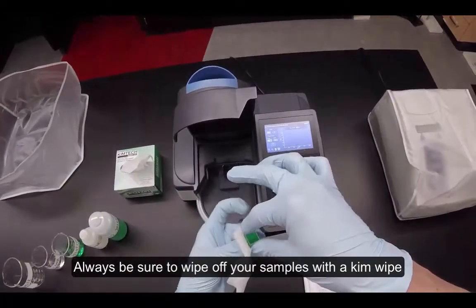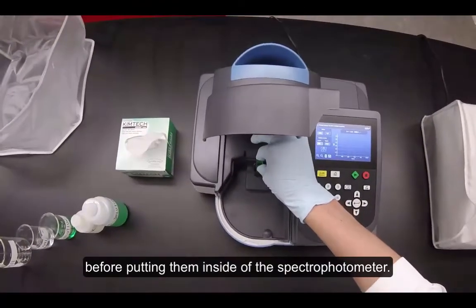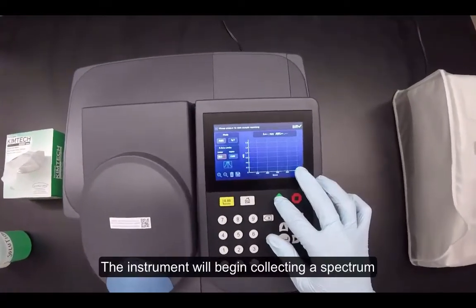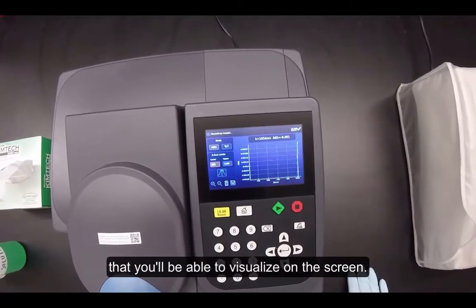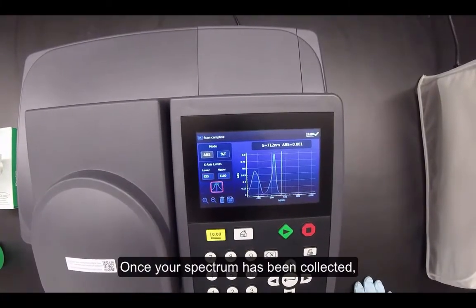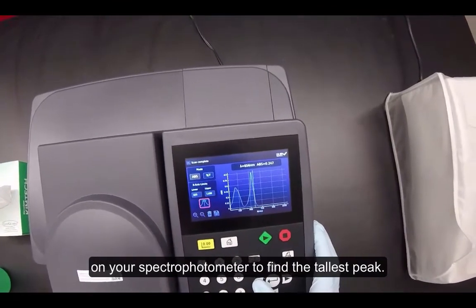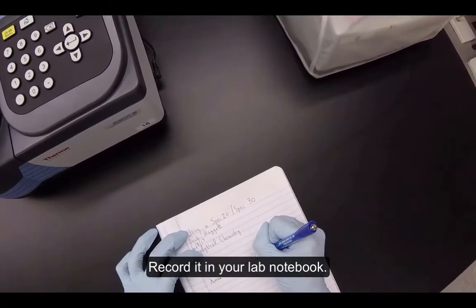Always be sure to wipe off your samples with a kimwipe before putting them inside the spectrophotometer. Close the instrument and press the green play button. The instrument will begin collecting a spectrum that you'll be able to visualize on the screen. Once your spectrum has been collected, navigate with the left and right arrows on your spectrophotometer to find the tallest peak. This will give you the maximum wavelength for your sample. Record it in your lab notebook.